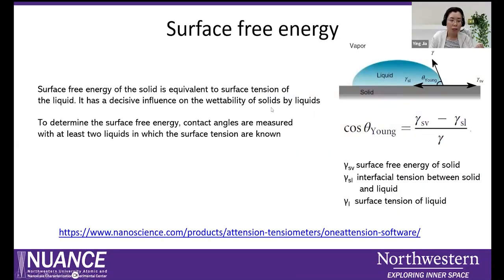The last measurement is surface free energy. Instead of describing a liquid, this describes the solid surface.